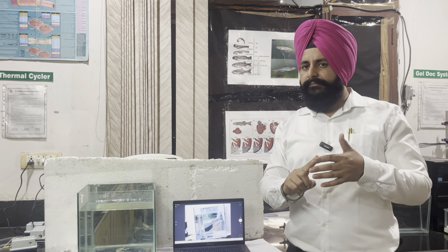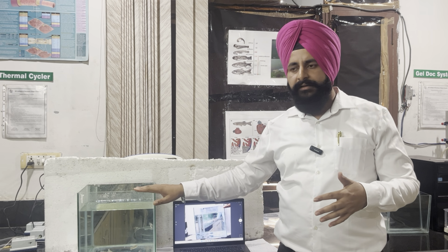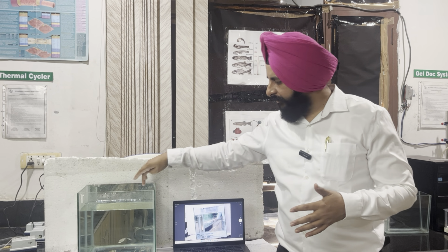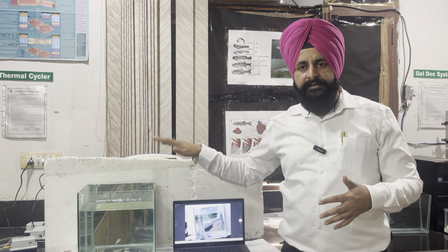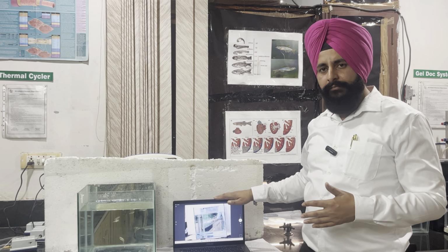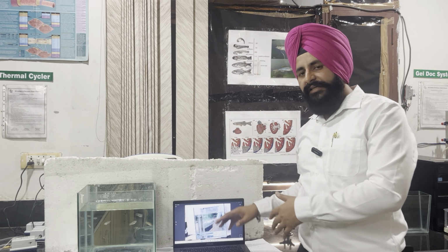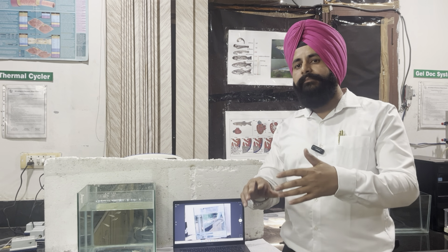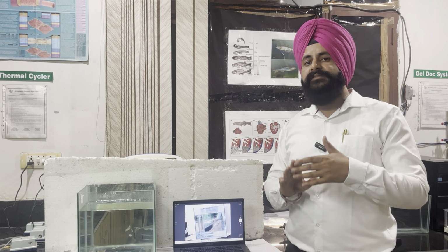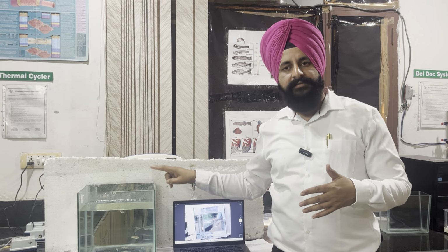What will be the requirements? You will need this apparatus, which is internally lined with a mirror. It is called the mirror chamber apparatus. The second thing, you need a laptop on which the software should be installed, and it should be connected to the third part, the webcam. So these are the three things required, and the fourth thing is your animal, the zebrafish.